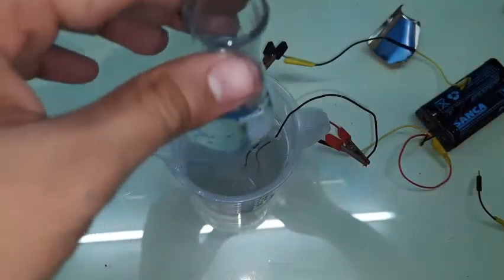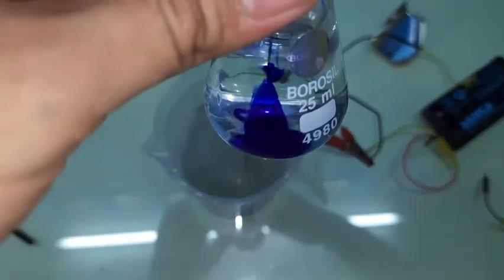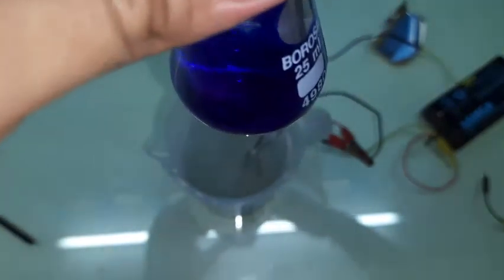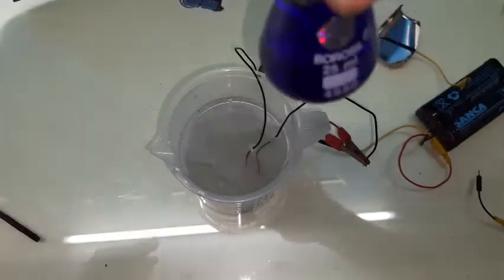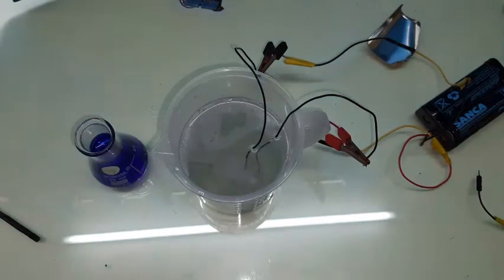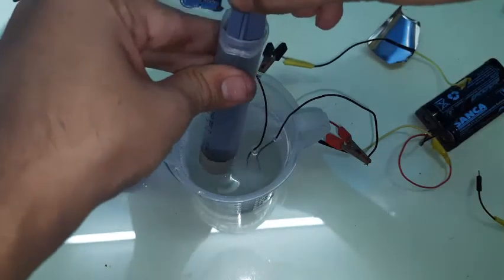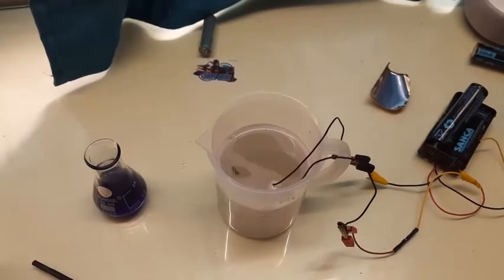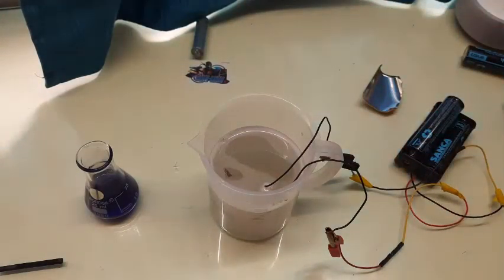Now take the beaker with water and add some ink — it's quite satisfying to look at. Shake it up a bit. Now we're going to take some fresh sodium hypochlorite solution. One thing I forgot to mention: when your solution is ready, you should smell a chlorine gas smell — like a swimming pool. Once you smell that, you can turn off the electrolysis.